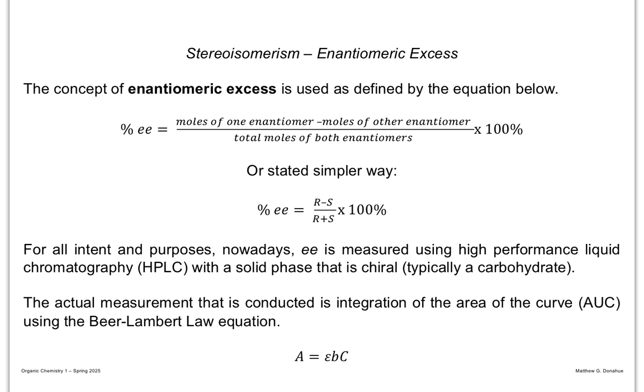So for example, what does that look like? For a racemic HPLC trace, you have some time 0, then the material is going through this column and it's being separated. You would see a peak, another peak, and then time is going on. Say that was R, that was S. That would be a 1-to-1 mixture of the areas.